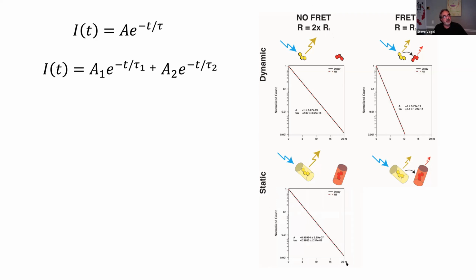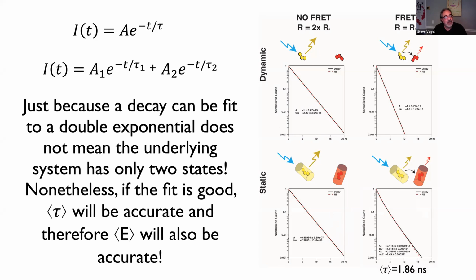single exponential. It's well fit to a single exponential. And again, here we measure 2.966. It's the same number mathematically, right? No difference between this and this. But now what happens in this case? What happens is it's not a single exponential decay anymore. It's a much more complicated decay, right?